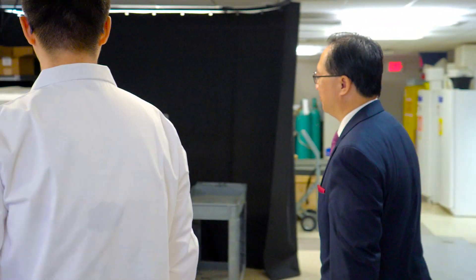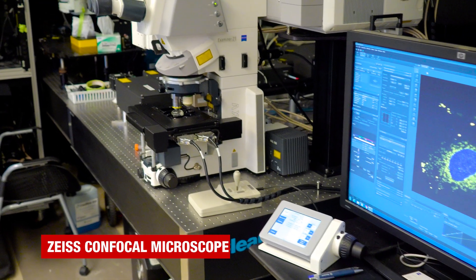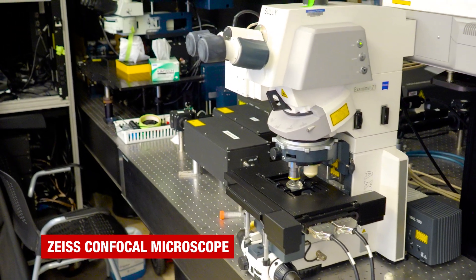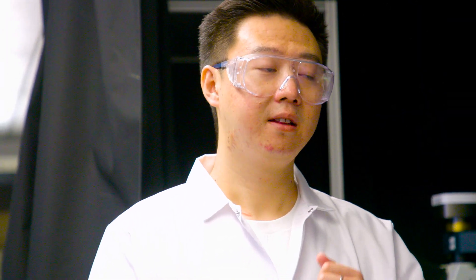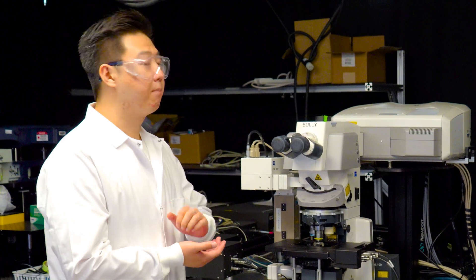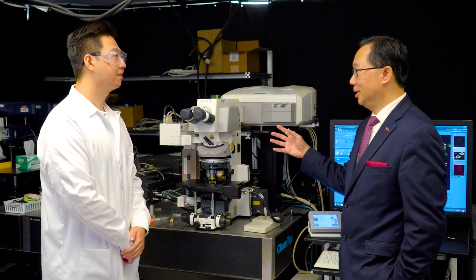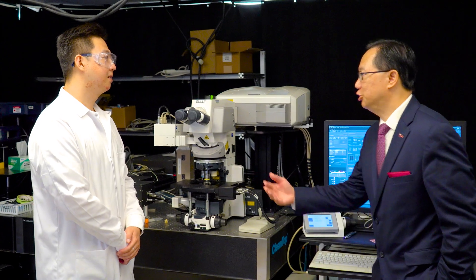This is an impressive lab. Thank you. What do you have here? Here is a confocal microscope. Compared with a normal or traditional fluorescence microscope, our confocal microscope has many advantages — like its ability to control the depth of the scan area, and also its ability to eliminate or reduce background information. That's very important. Most other kinds of microscopes cannot do a three-dimensional scan. So, what's the advantage of that? Can you show me?